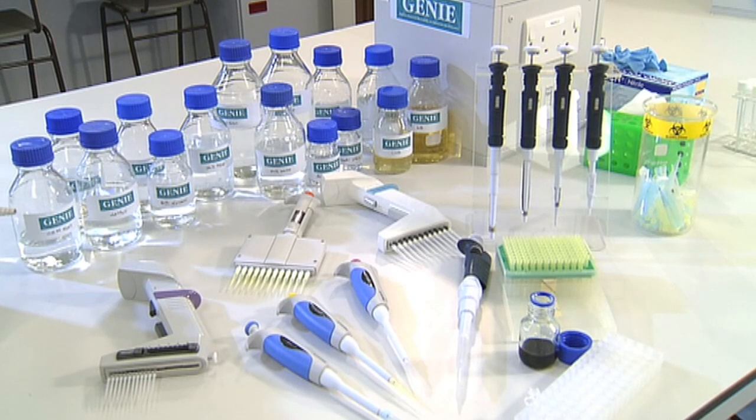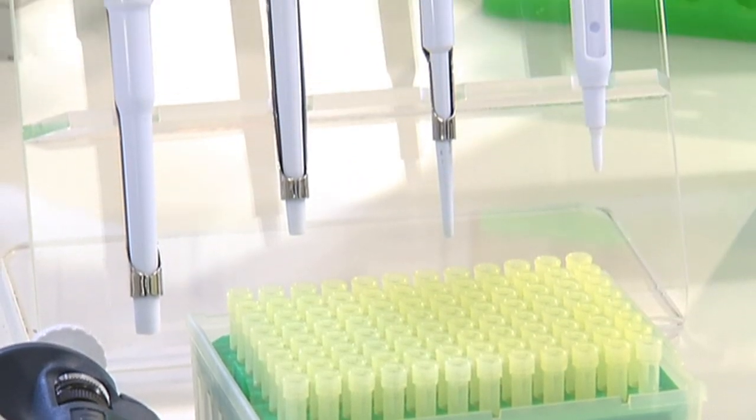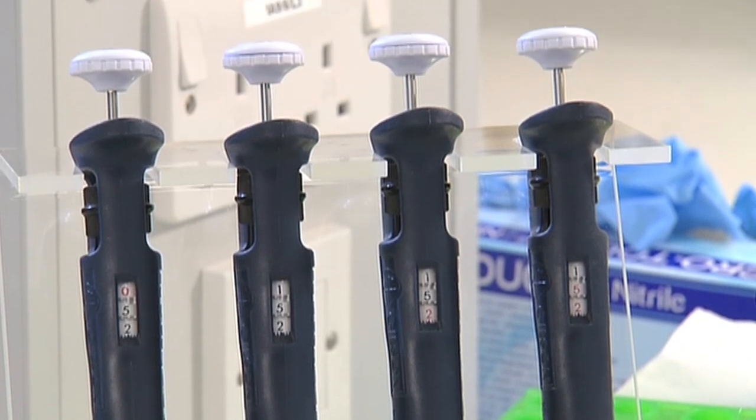Gilson or Finn micropipettes are one of the most commonly used instruments in a molecular biology laboratory. They're used in conjunction with plastic disposable pipette tips to measure or transfer small amounts of liquids, usually from 0.2 microlitres to 1,000 microlitres or 1 millilitre.